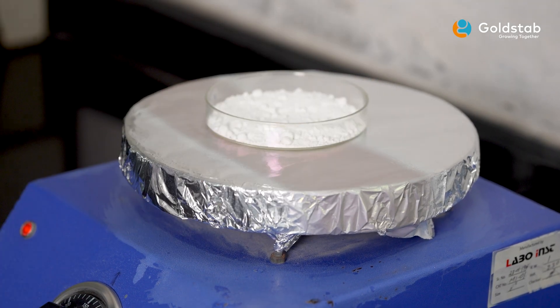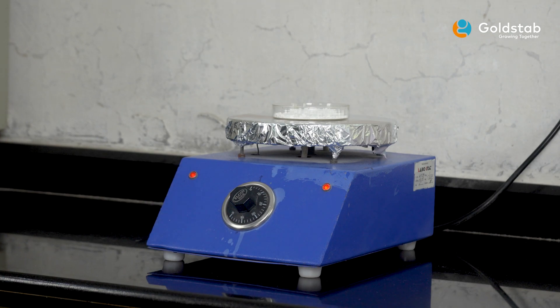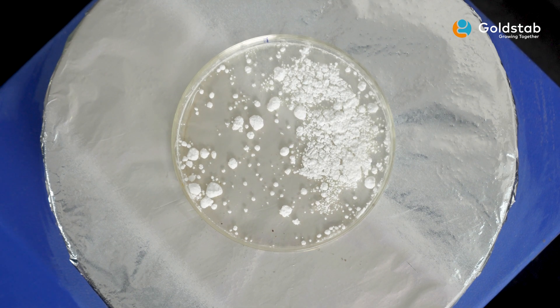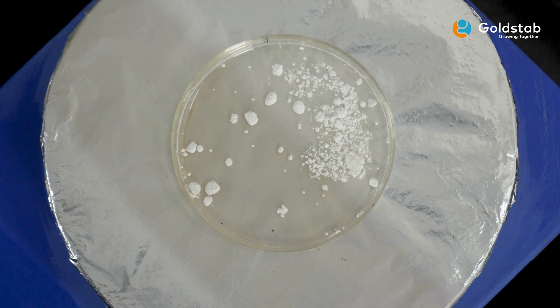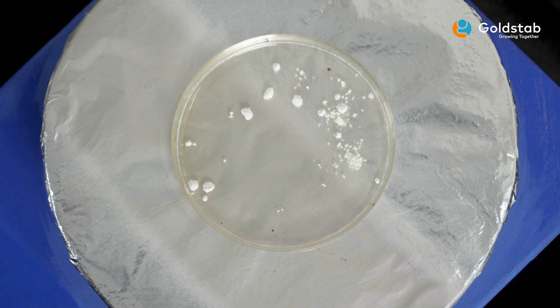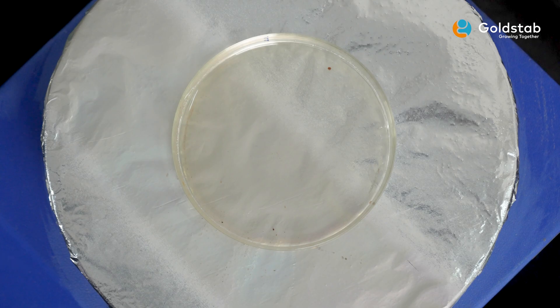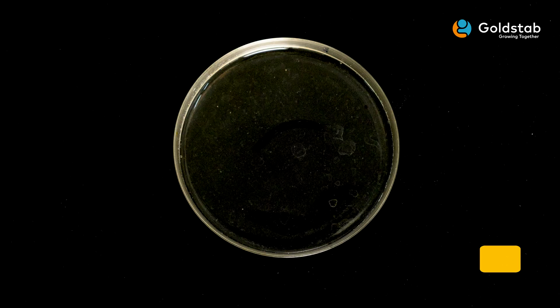Place the petri dish with the zinc stearate sample on the hot plate and wait until the zinc stearate is melted completely. Then pick up the petri dish and place it on a clean surface. Observe the melt of zinc stearate.